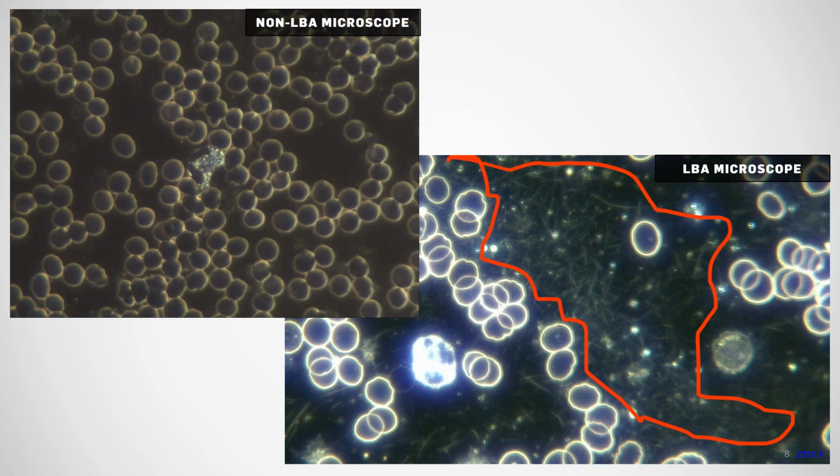Absolutely. Just looking at the white blood cell there, for example, Elizabeth, the white blood cell right at the center there is a granulocyte. It looks like it might be an eosinophil. We have a white blood cell, also a granulocyte, most likely a neutrophil, in the other image. And just compare the brightness. That's already a very strong indicator of what's lacking in this other system. Yeah, yeah.